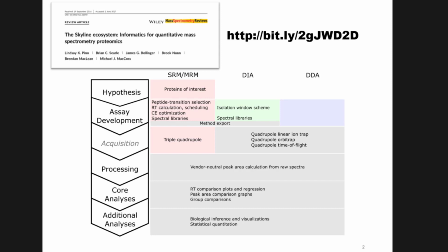What if now you had actual chromatograms for all of your peptides, and you could start doing some of these calibration and validation experiments to decide the best peptide? So as you get more and more prior knowledge, you're getting better and better candidate peptides that will act as good proxies for the protein that they're supposed to be representing.